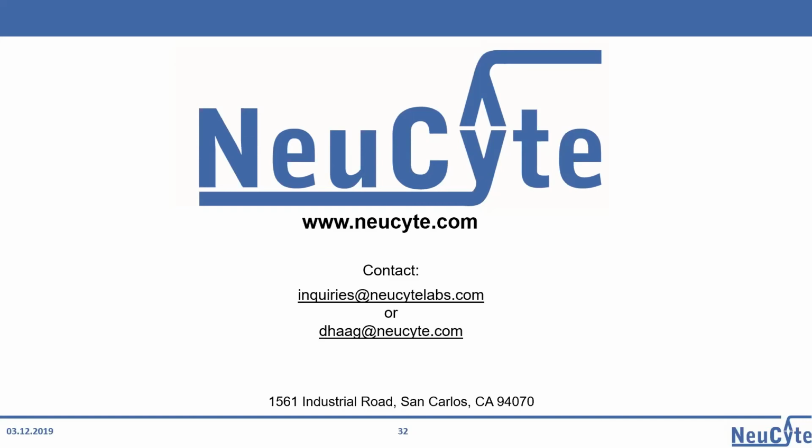Okay. Do the anti-epileptics and sedatives that produce effects that block proconvulsant drugs, do these compounds also produce effects on their own at similar doses?